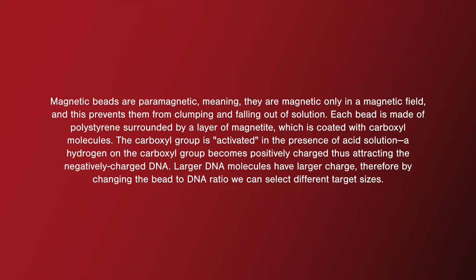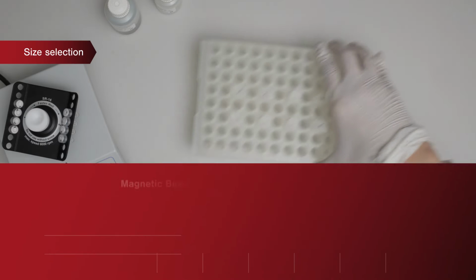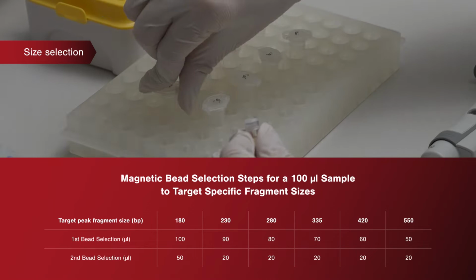Larger DNA molecules have larger charge. Therefore, by changing the bead to DNA ratio, we can select different target sizes. 50 microliters of DNA sample plus 50 microliters of beads will give a bead to DNA ratio of 1. General rule is, the lower the beads to DNA ratio, the larger the final fragments will be at elution. You can study the table on the screen.